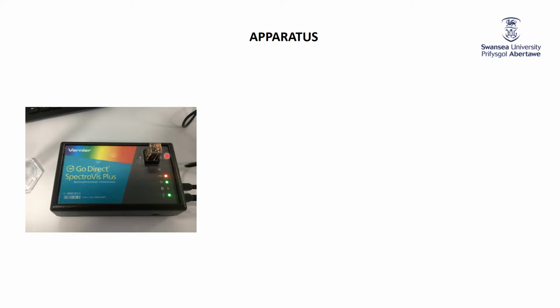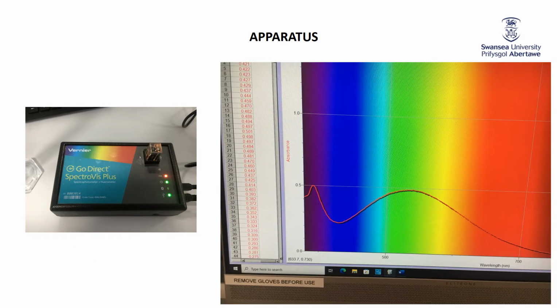Knowing what goes in and measuring what comes out enables the computer to plot the absorbance, and we'll get something like this. Along the bottom is the wavelength of the different types of visible light. This background shows that the shorter wavelength, higher energy visible light is purple, and then you get that famous sequence going through violet or purple, then blue, green, yellow, orange, and then red. This of course is the longer wavelength, lower energy end of the visible spectrum.